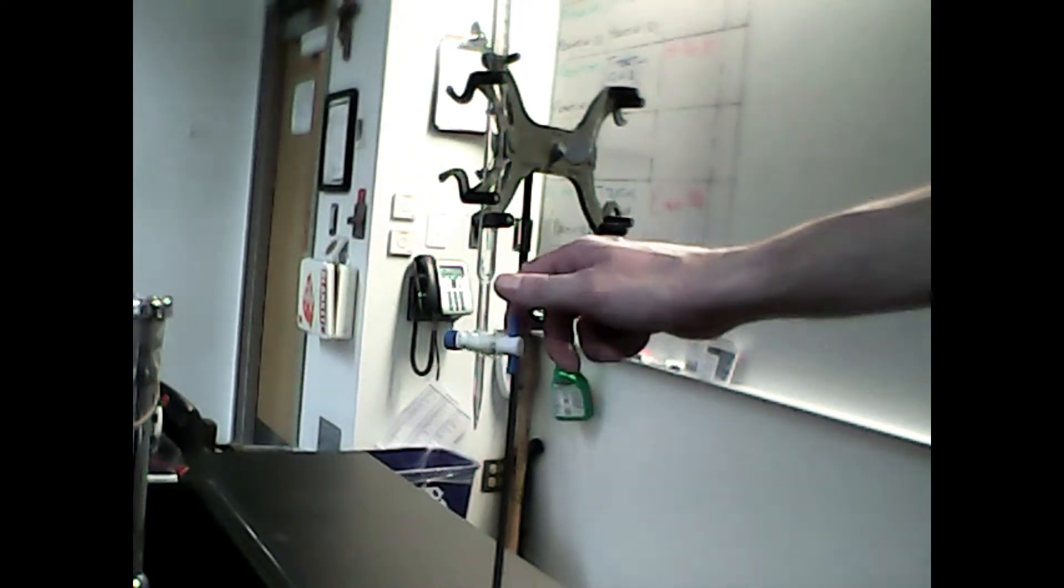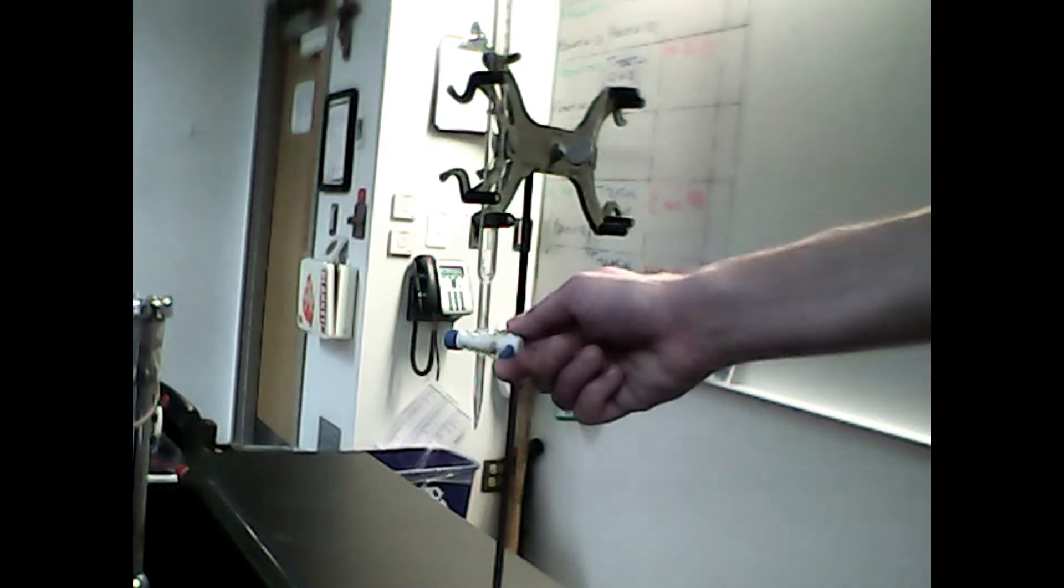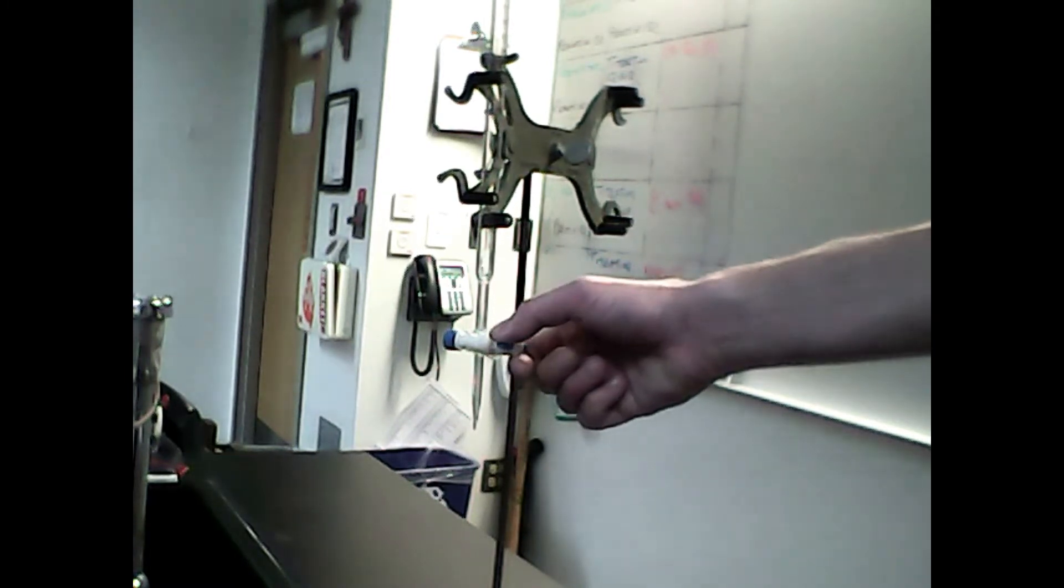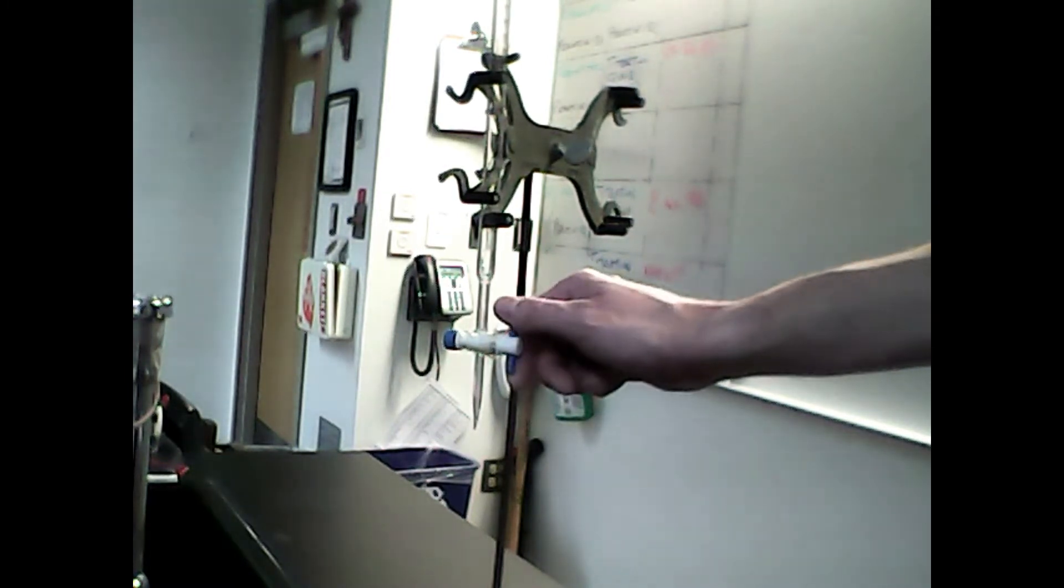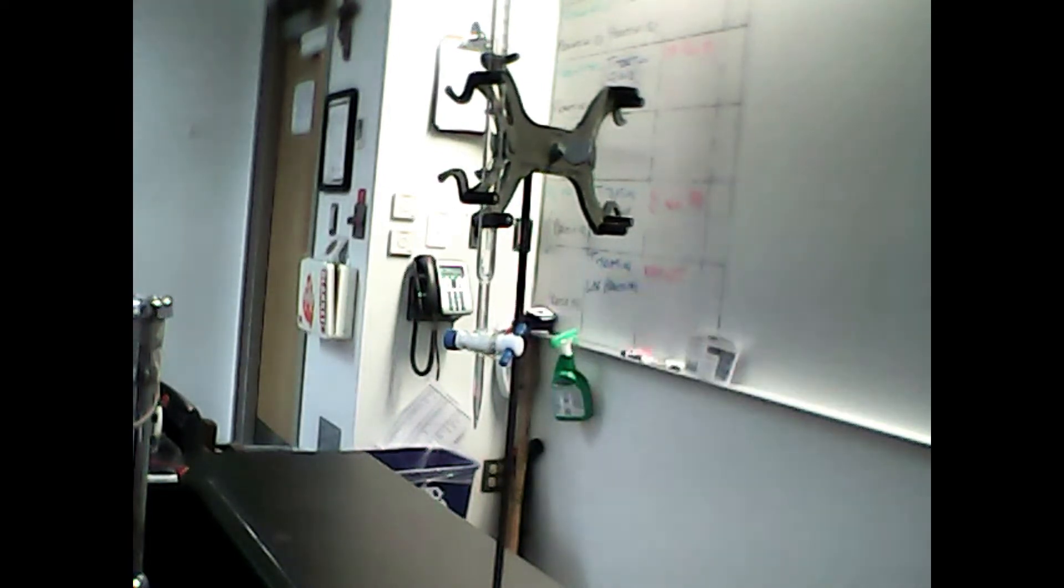We do that simply by turning this knob. This would be off, and this is on. Of course, you can regulate the speed at which your solution is metered out by how far you turn this valve.